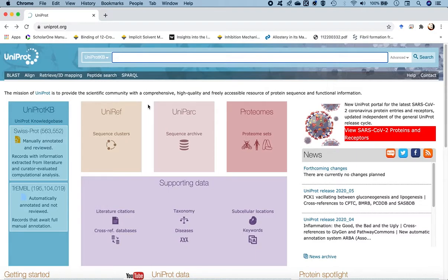So most of the structures in the crystallography method by crystallographers are obtained by dissolving them in a water environment or using some crystal waters in order to obtain the structure. So, okay, let's go ahead and obtain the sequence, the primary sequence, the protein sequence for the dopamine D1 receptor first. So, as we type in here, the dopamine D1 receptor, and then press enter.